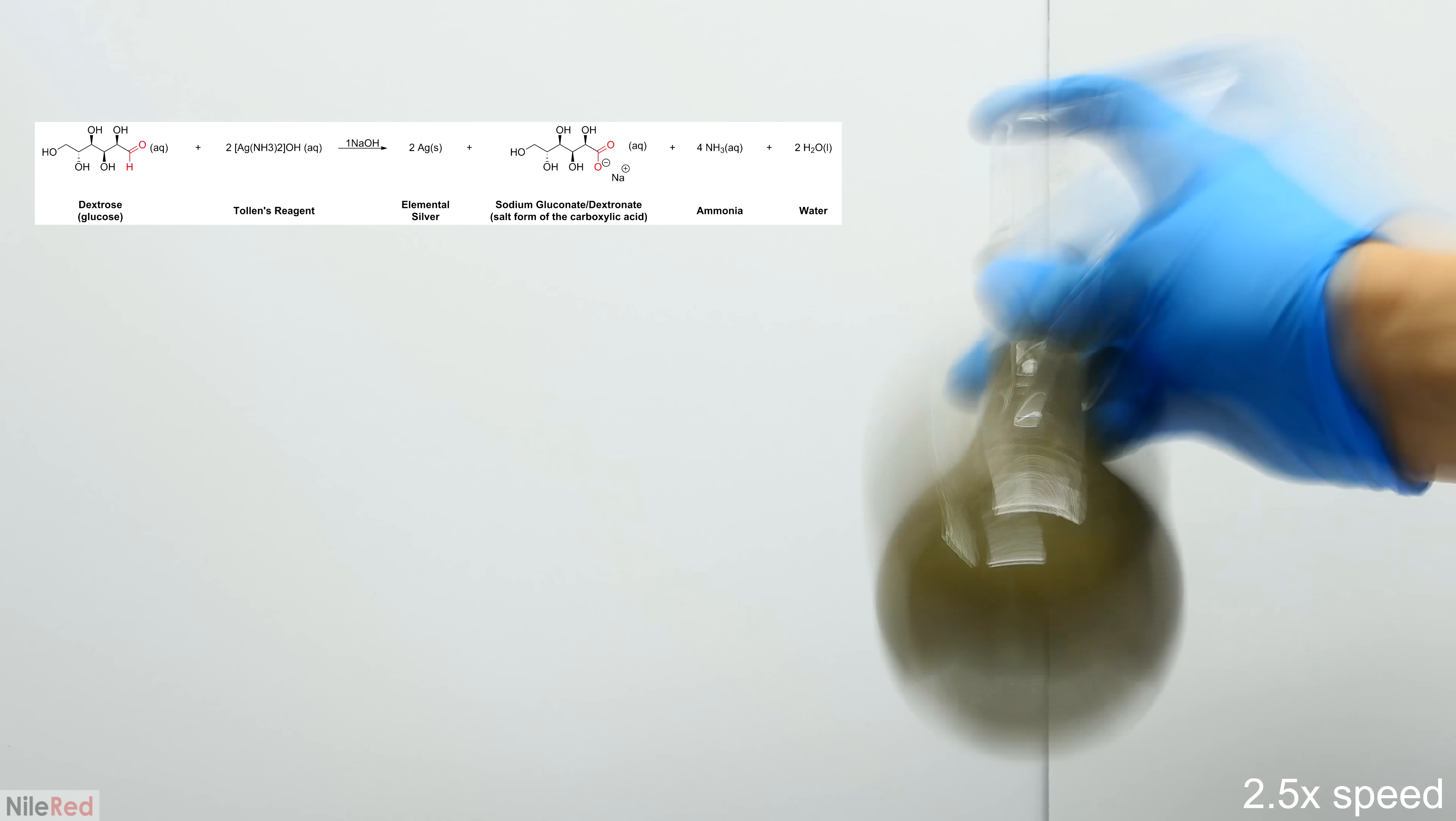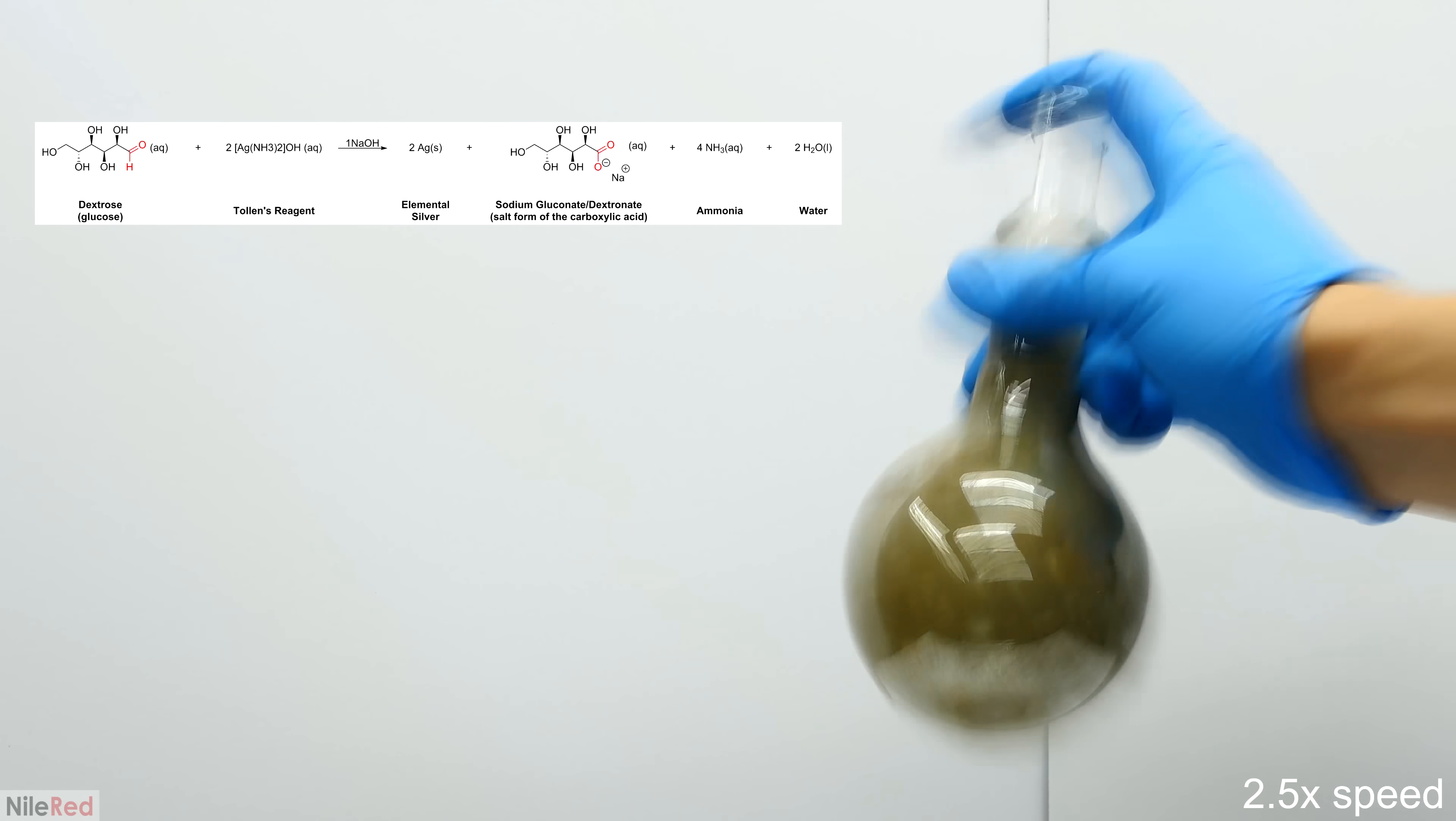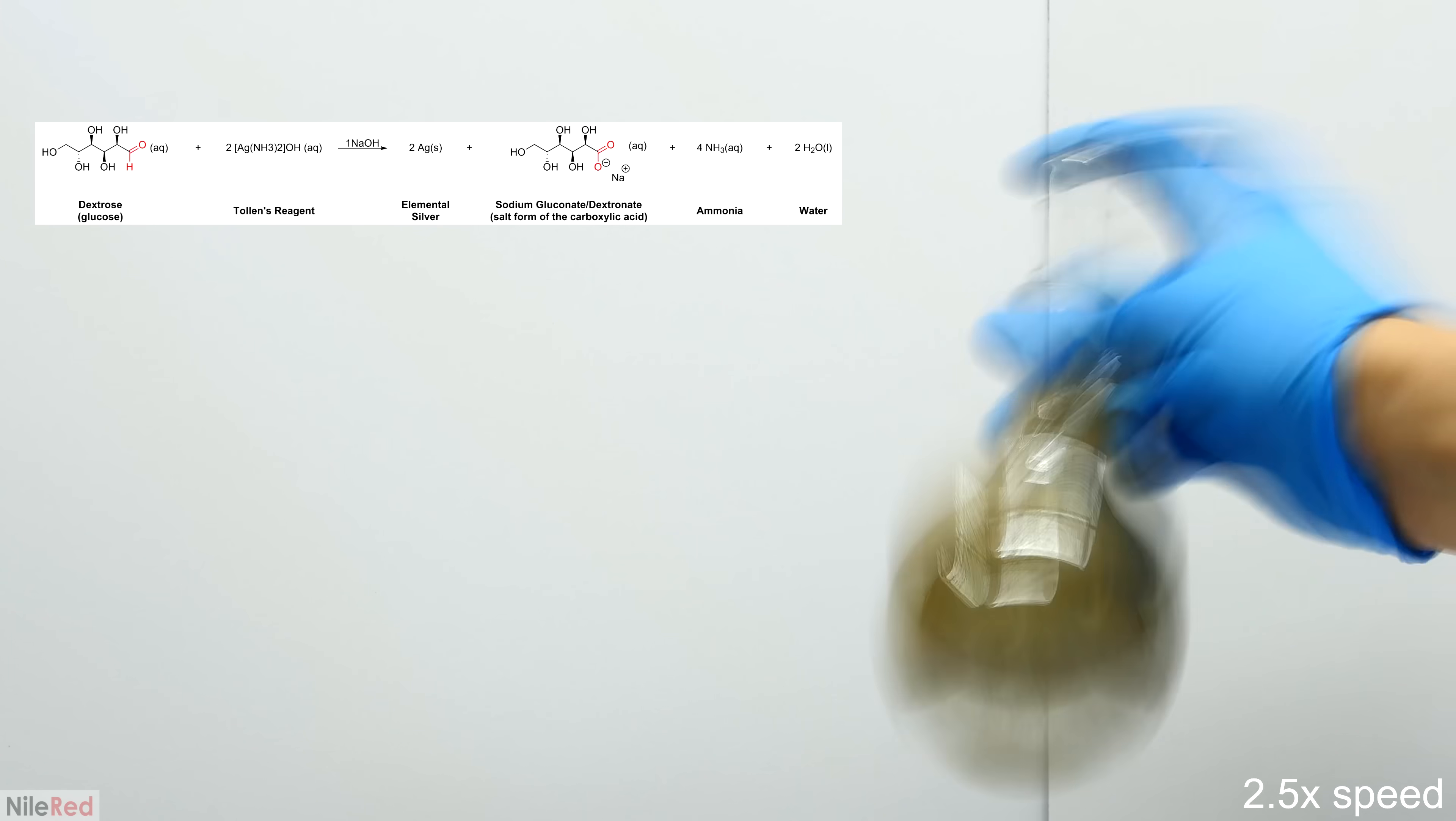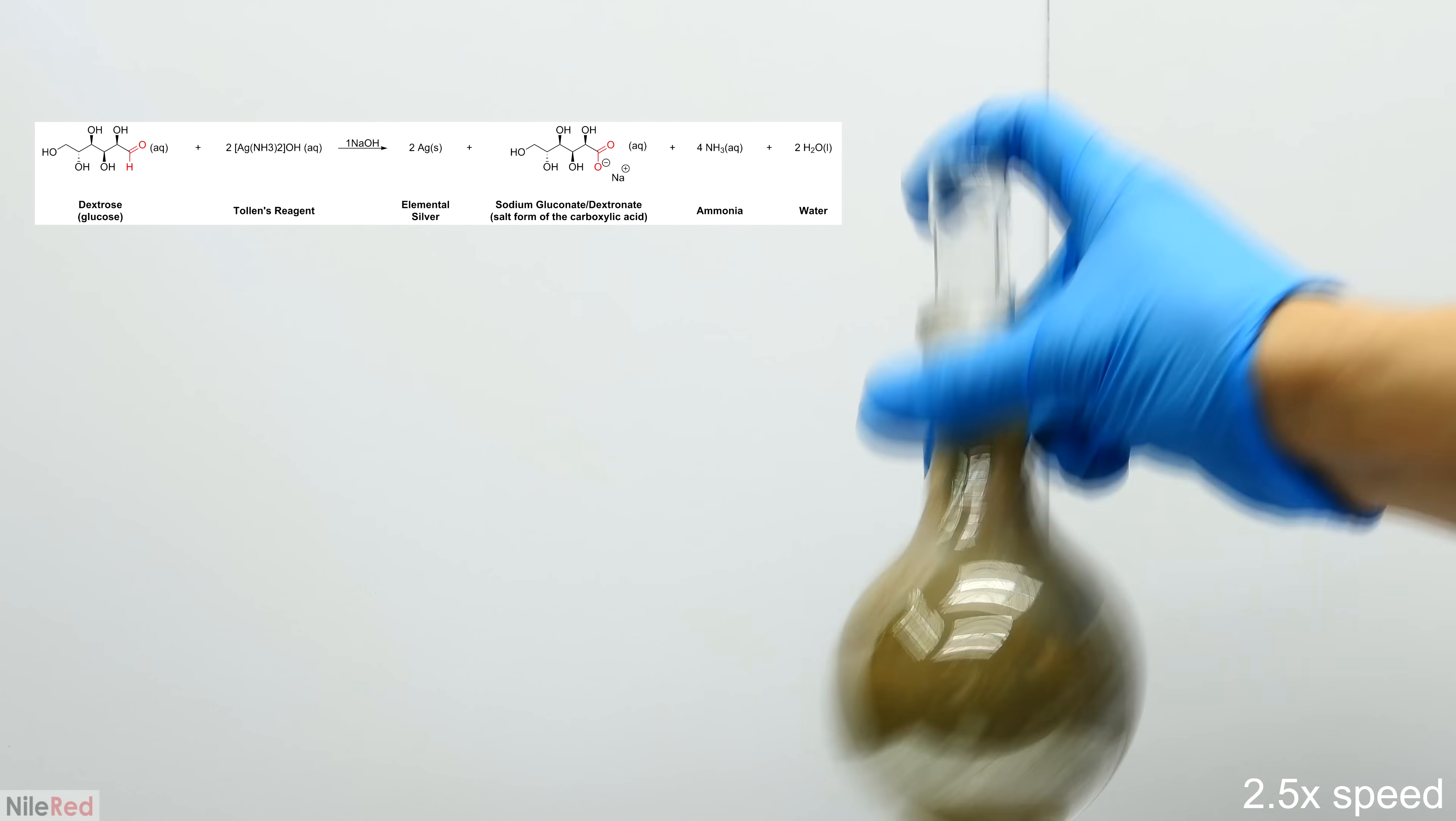When the Tollens reagent is reduced, the complex will fall apart, and the silver will be reverted back to elemental silver. As the silver is formed, it precipitates as a very fine particulate, which slowly settles on the walls of the glass.